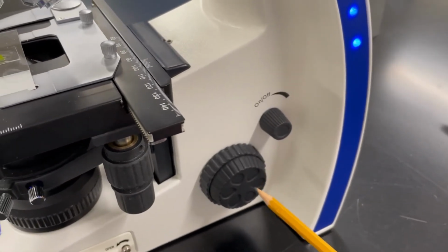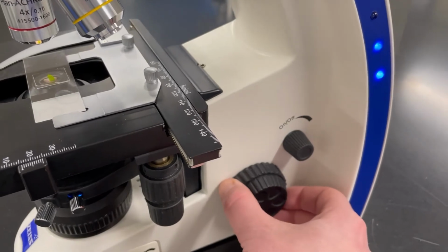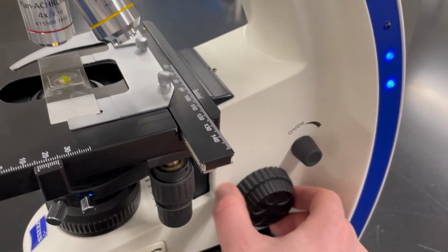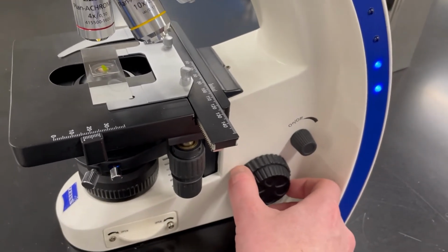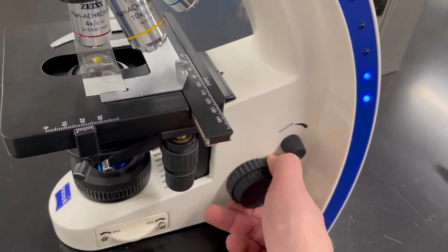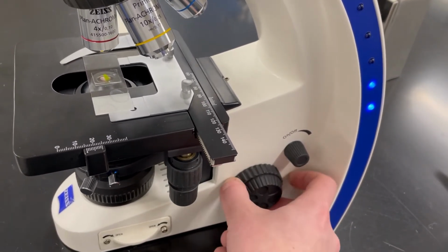Down here, these are the focus knobs. So in order to focus, what I need to do is turn the one on the outside. There's actually two knobs, one on the outside and then the one on the inside here. Watch what happens when I turn the coarse adjust knob, which is the one on the outside. You can see the stage goes up and down. This will focus and get kind of a rough focus.